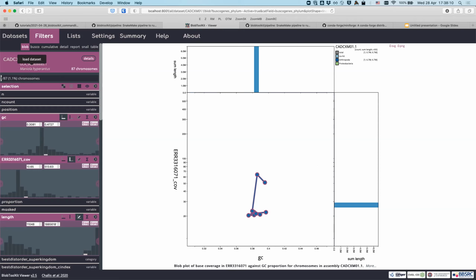And the idea is that there's a new visualization, and we're always making new visualizations. Rich is very, very clever at thinking of new things. We haven't yet figured out how best to use this. I will come up with good examples, but that's the idea.